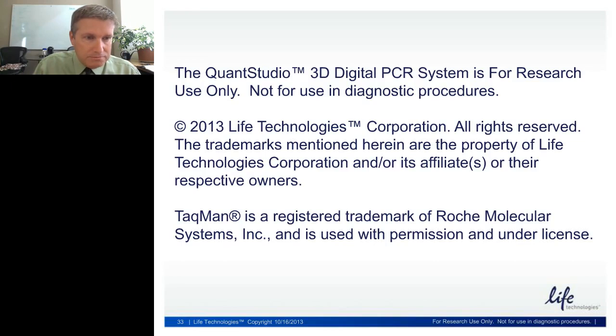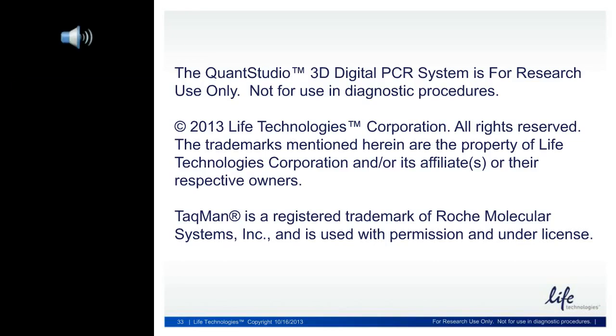Mary, back to you. Thanks, Steve. We have one more question before we wrap up. And again, from Agnes, a follow-up question. Can TaqMan molecular beacon probes be applied to this digital PCR platform?